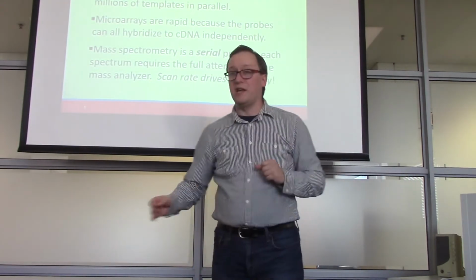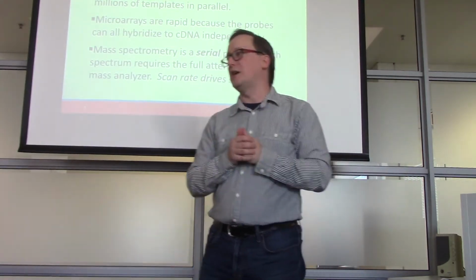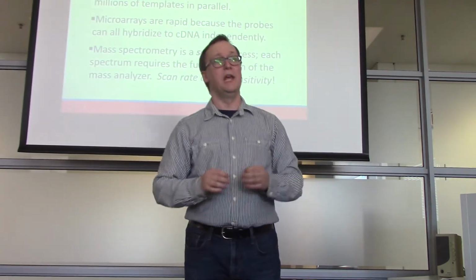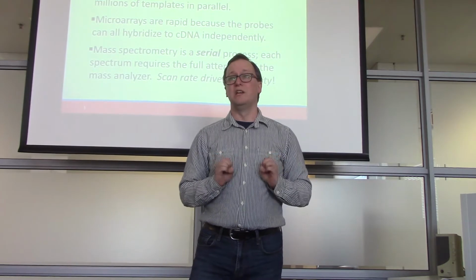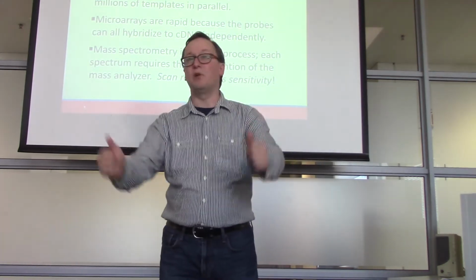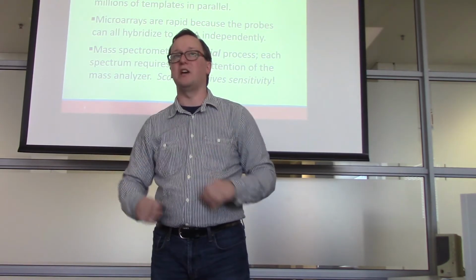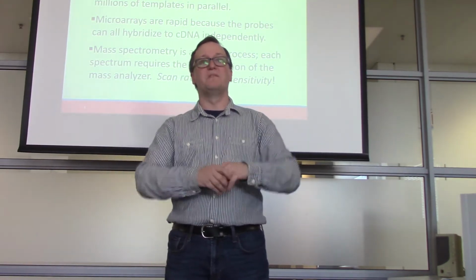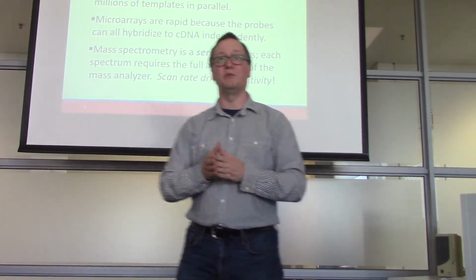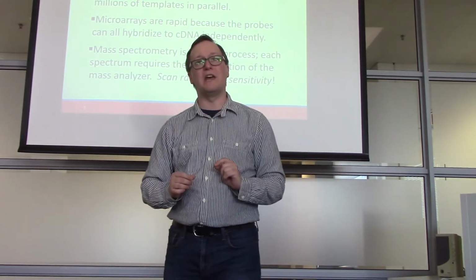So I'm going to start by thinking that you might have spent a whole lot of time thinking about microarrays or a whole lot of time thinking about next-gen sequencers. And one of the ways in which these things work is through massive parallelization, right? You can measure every probe sequence for a species at the same time in a microarray. You can sequence millions of templates all at the same time in a next-gen sequencer. But mass spectrometry doesn't work that way.